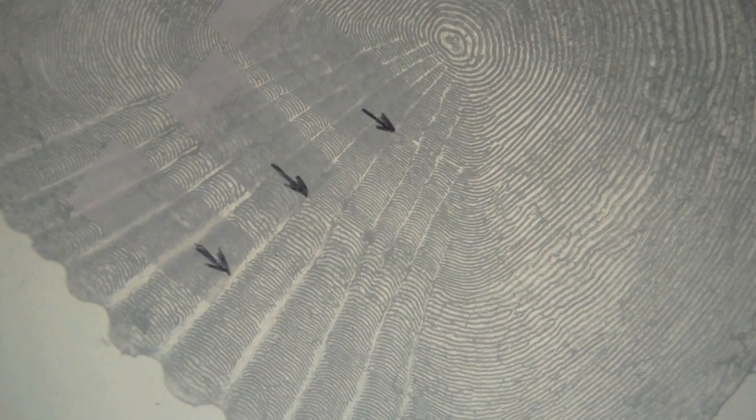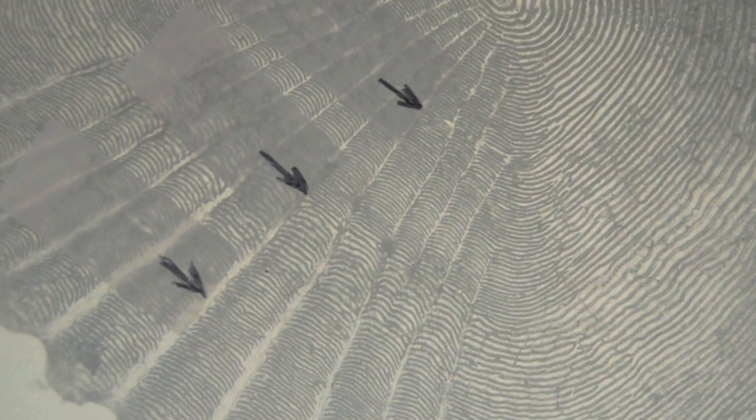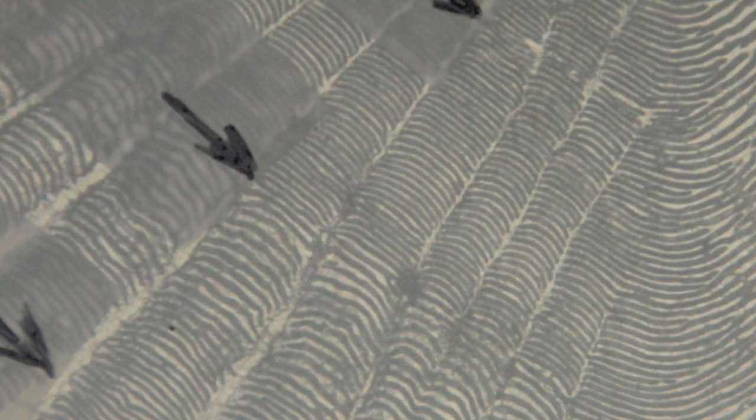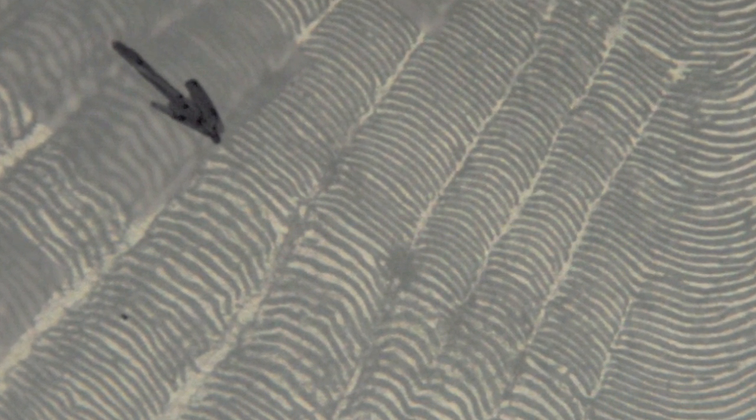If you look closely at where the center arrow is pointing, you can see the end of a year in the fish's life, as it goes from slow growth in the colder months to faster growth in the warmer months.